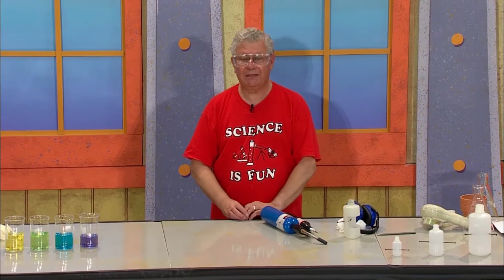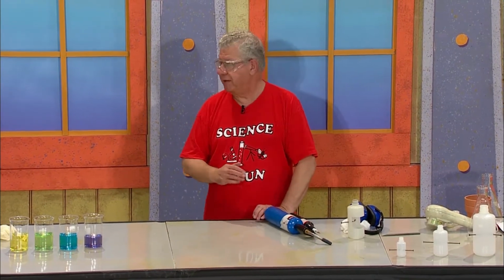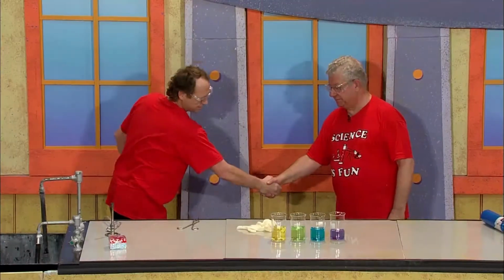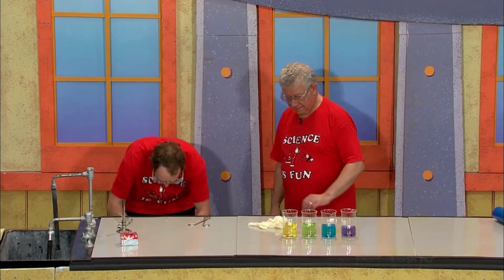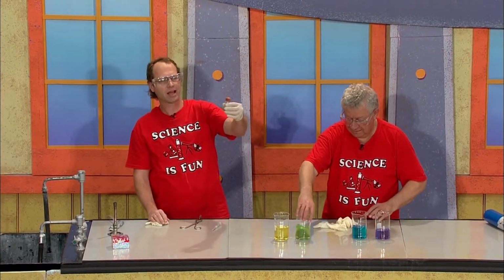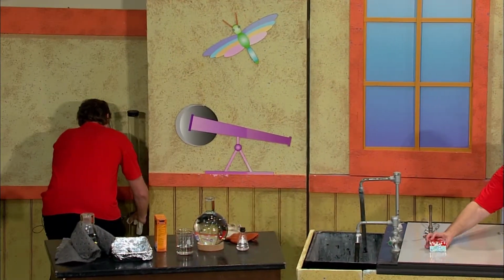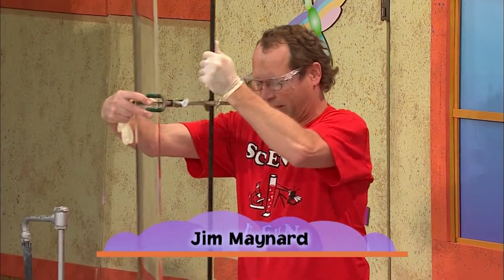At this time, I would like you to welcome our chemistry lecture demonstrator, Mr. Jim Maynard. Hi, Jim. What do you have for us? I have a demo for you that involves this syringe and this small Erlenmeyer flask with a clear and colorless substance in it. And I actually have one more thing I need. Okay, so this is my demo.